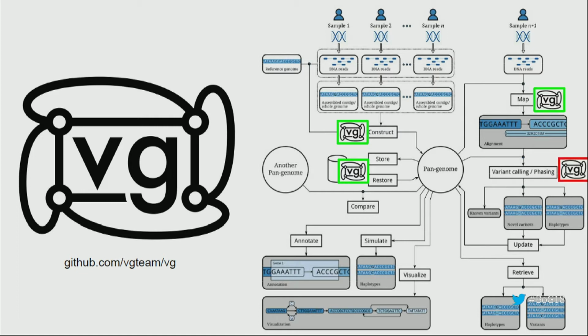And then using those alignments, we can do variant calling. We can then take the variants and actually update the reference system. And we want to interrogate the database that's associated with it. We can visualize it as you've seen. We can simulate reads. And of course, importantly, we can annotate the reference system with existing annotations in other reference objects that we already have.